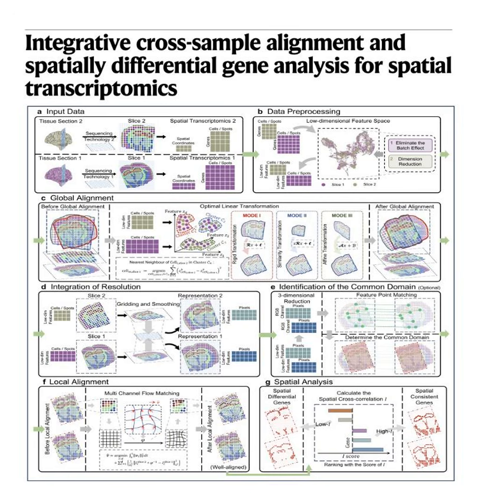Functionally, yes. And the reason this is so clever is that by converting it into an image format, CODA can borrow highly advanced image matching AI that already exists in the computer vision world. Oh, wow. Yeah, it uses a transformer-based AI model, similar to one called LightGlue, to visually match key points between the two slices. So it looks for matching visual patterns in the gene expression. Exactly. Once it finds those matching anchor points, it crops out a common domain. It isolates the overlapping region, so it is strictly comparing apples to apples, or downtown to downtown, in your analogy. That is incredibly smart. Instead of trying to invent new spatial biology math from scratch, they just translated the biology into a format where existing computer vision AI could solve it. It's a massive shortcut that saves an incredible amount of computational time.